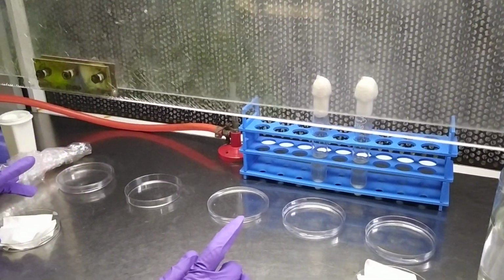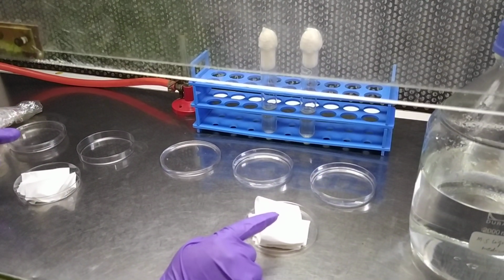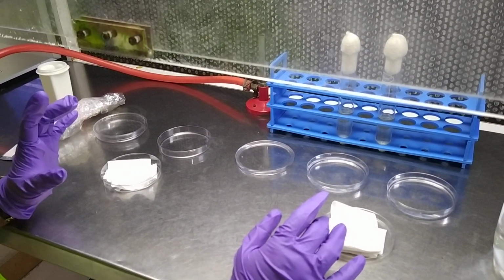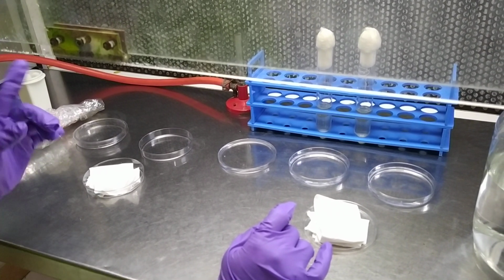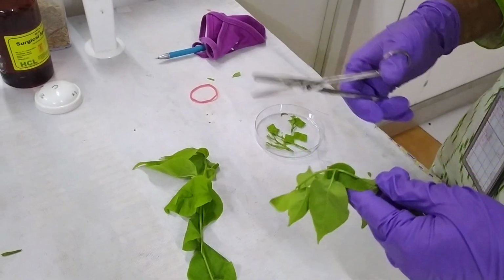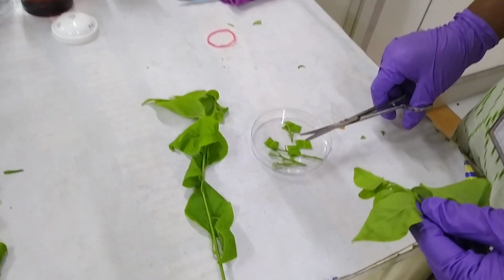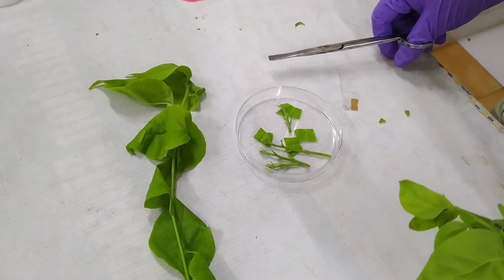Once all these setups are ready, sterile tissue papers are also required. To ensure one more step, after arranging everything, we'll turn on the UV for another 5 minutes. After 5 minutes, we'll take the explant inside the laminar and start the experiment. Earlier, we have to collect the explants. Explants are the inoculum from which the cells or tissues are going to develop.